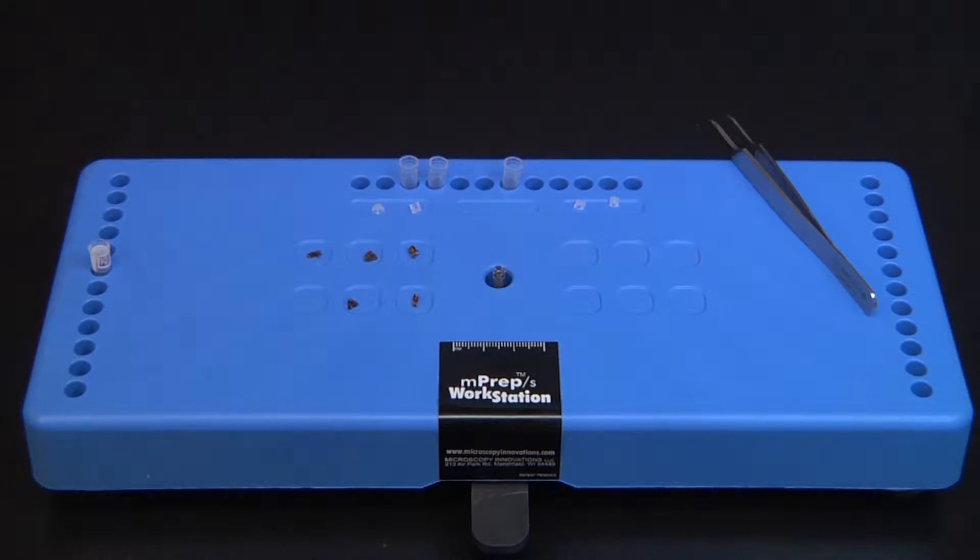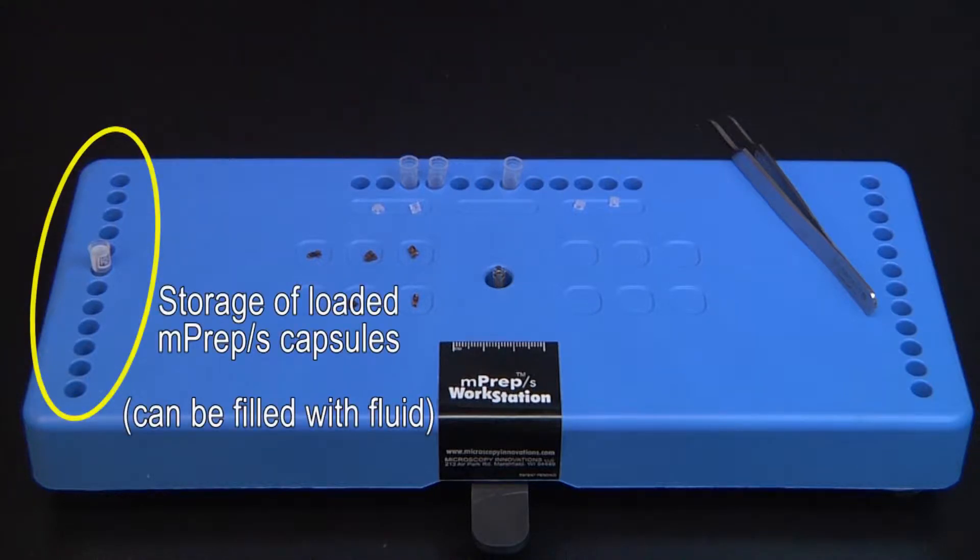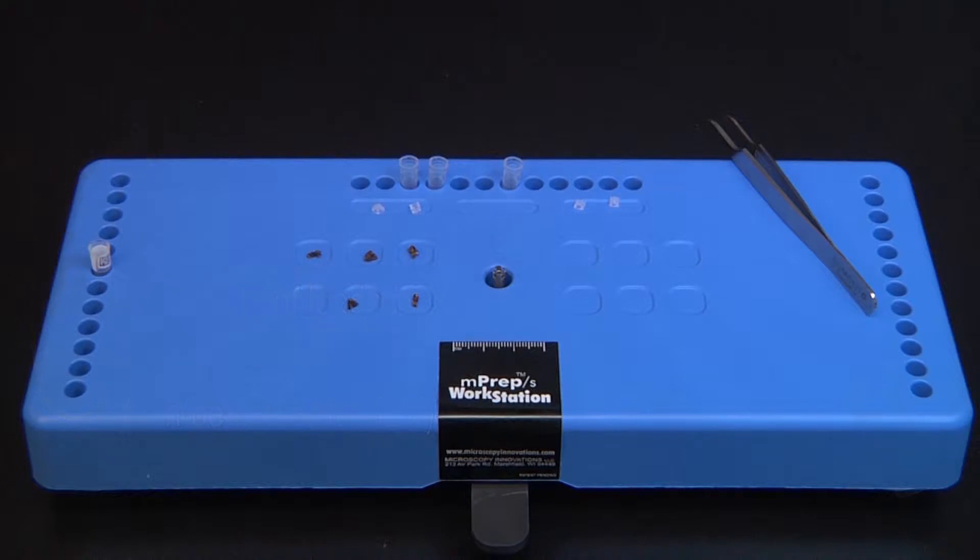Both sides of the workstation have 12 wells to hold MPREP capsules after they have been loaded with specimens. These wells can be filled with buffer or fixative to keep specimens immersed until processing. The spacing between capsule wells matches your multi-channel pipetters to enable fast and easy subsequent processing.